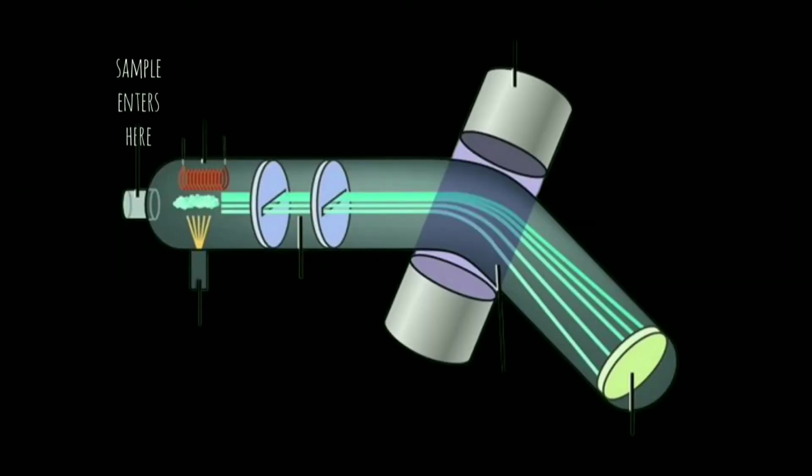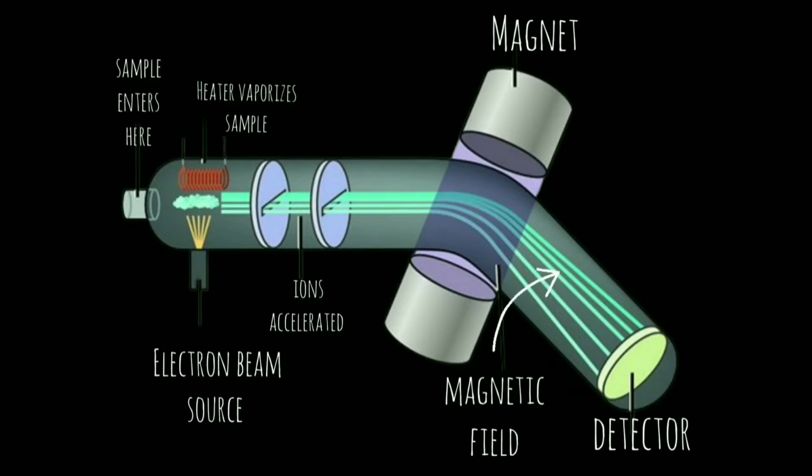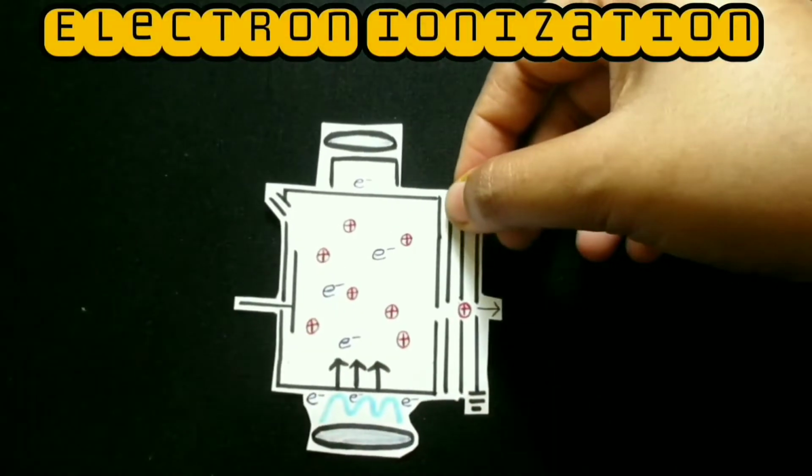A sample molecule studied by mass spectrometer must be converted to gas phase charged particles by the ionization process before they can be analyzed and detected. Several methods are used for converting the sample to ions. These processes are fundamentally different techniques, but they achieve essentially the same end result, which is the generation of gas phase ions via non-destructive vaporization and ionization. First, we are going to discuss electron ionization.